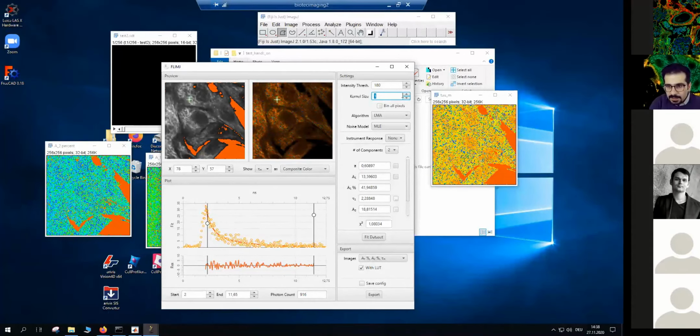Marianne is saying that's explaining something. Stella said maybe fuse ROI before starting FLIMJ. Yeah, that's what Stefan also mentioned. That might be something we can do. So we do the region of interest before it comes to FLIMJ. I can crop the image, and then I have a new image and just do all the analysis on that new image. Yes, that's a way to do that.